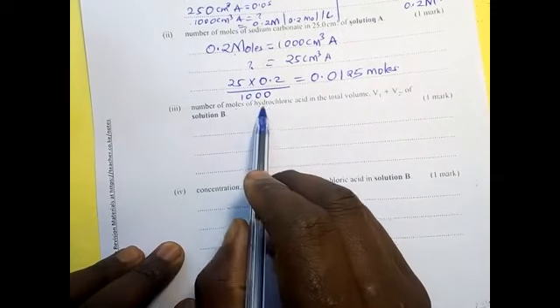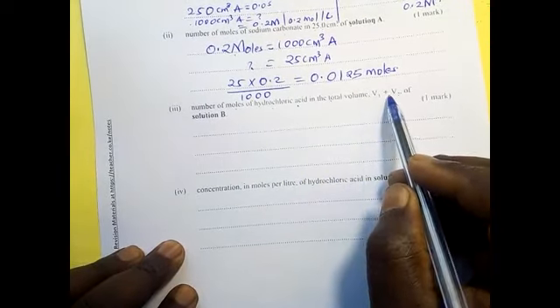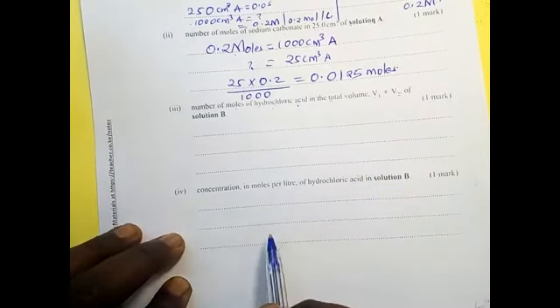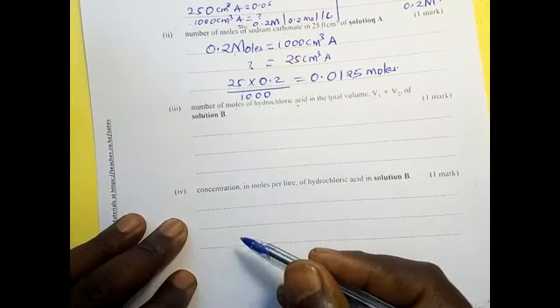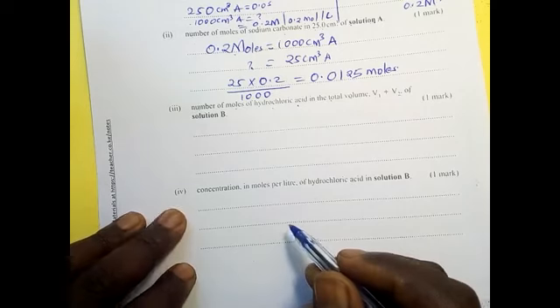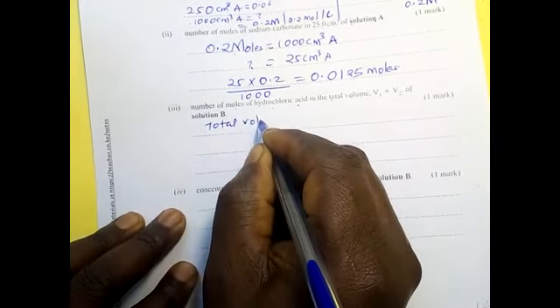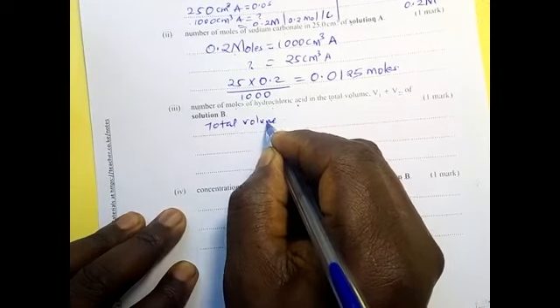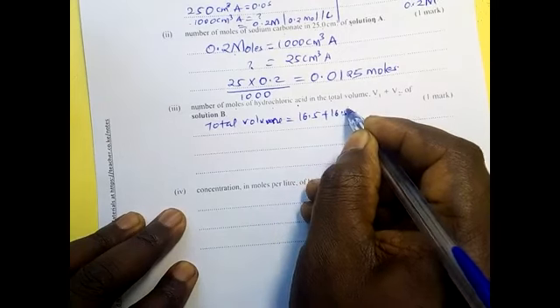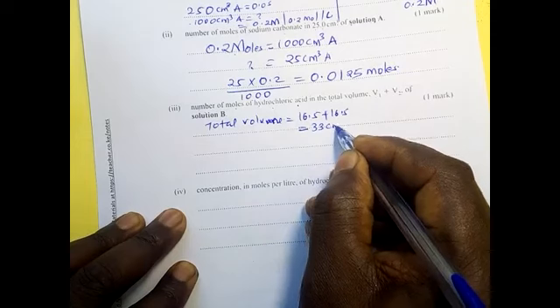Calculate the number of moles of hydrochloric acid in the total volume of V1 and V2. Now remember V1 we used 16.5 and V2 was 16.5. So the total volume would be 16.5 plus 16.5, which is equal to 33 centimeters cube.